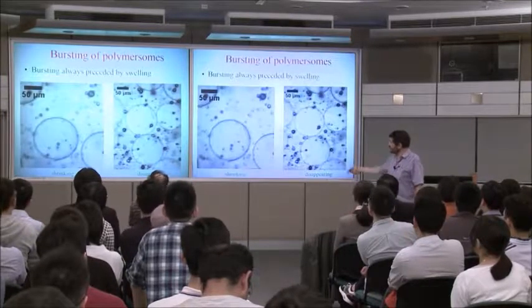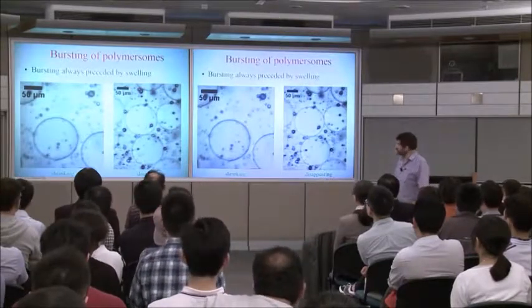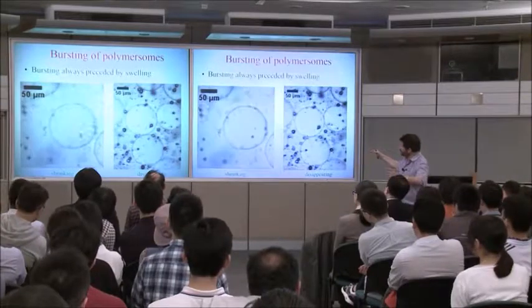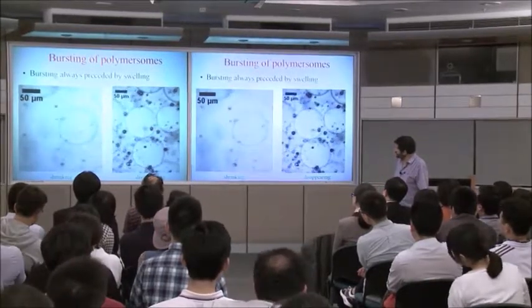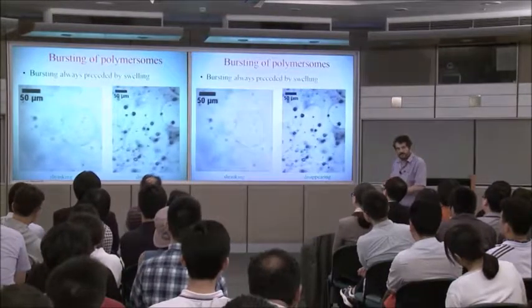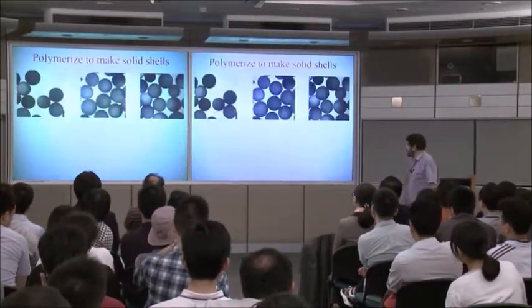Actually, it's interesting to watch. This is one of these polymersomes, and this is now put in a low osmotic pressure to watch it explode. And look what happens. You see how it gets larger? Water's rushing in, and then boom, a little hole develops, and it starts to shrink. Watch this one. Gets larger. It always gets larger because water rushes in. It's got this low pressure on the inside. Water's rushing in, and then it completely disappears. So here's a second way to release it.